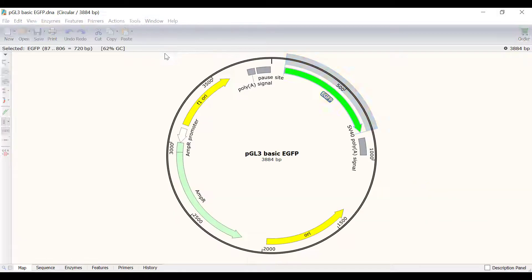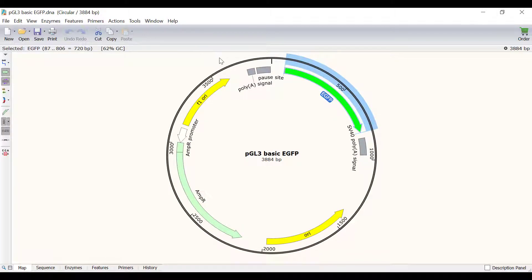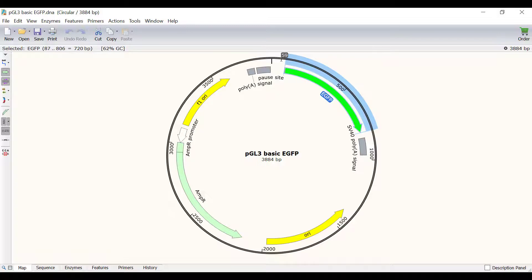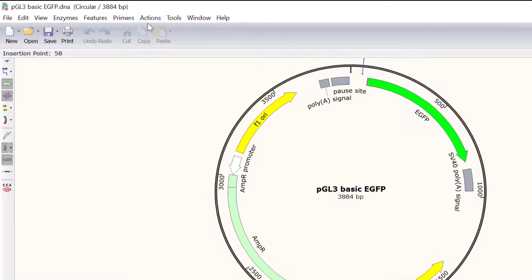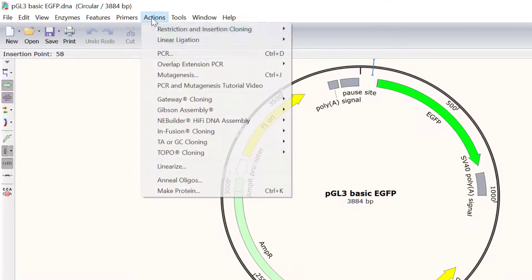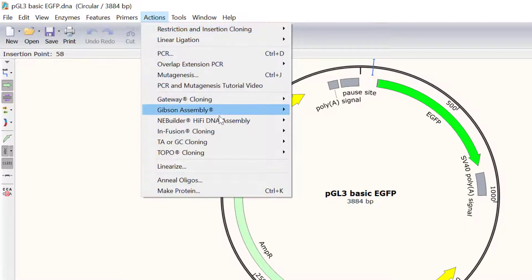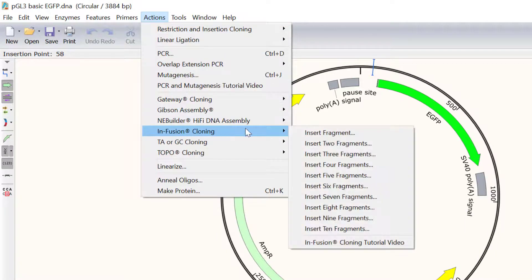Specifically, I want the gene to be placed just before the GFP reporter around here. To perform infusion cloning in Snapgene, go to Actions Infusion Cloning Insert Fragment.